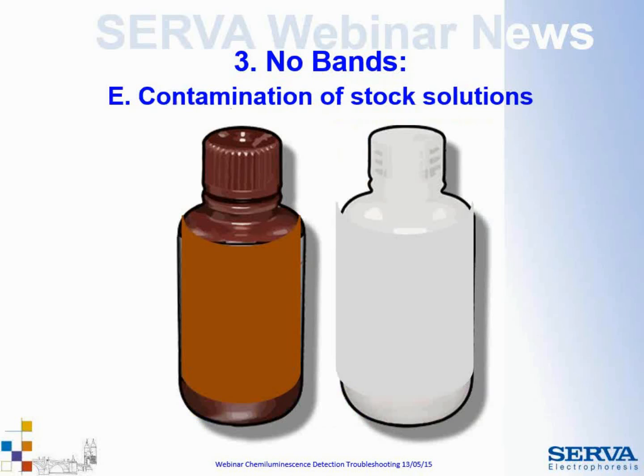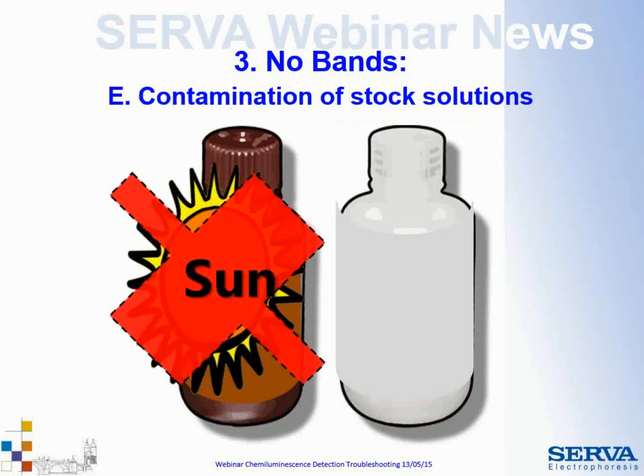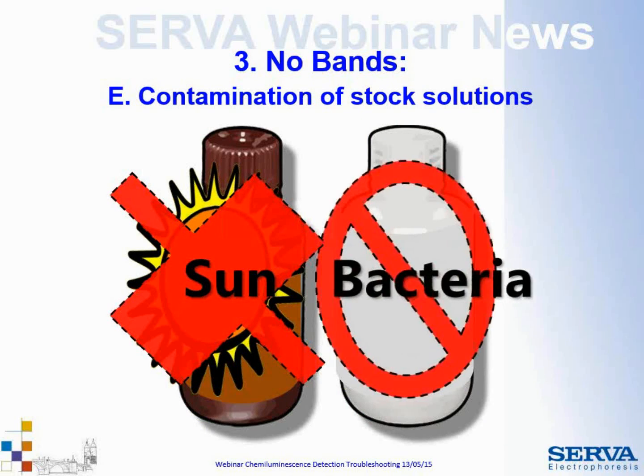Also, contamination of the stock solution can lead to absent bands, so you have to make sure that these solutions are neither exposed to sun nor contaminated by bacteria.